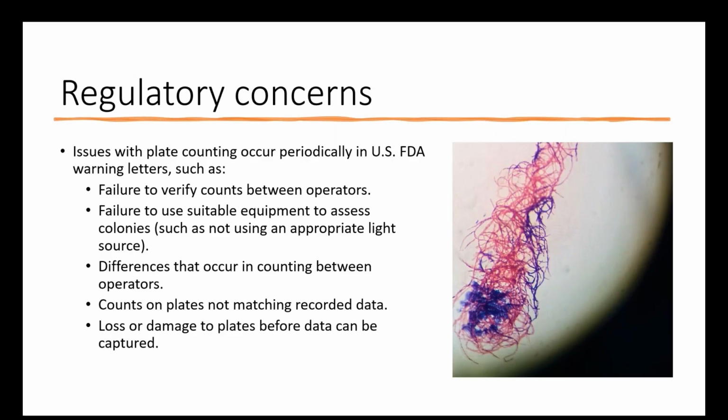Some of the things that appear in these FDA concerns include failure to verify counts between operators, failure to use suitable equipment to assess colonies, so not using appropriate light sources, not using colony counters at all, not using magnifying instruments.